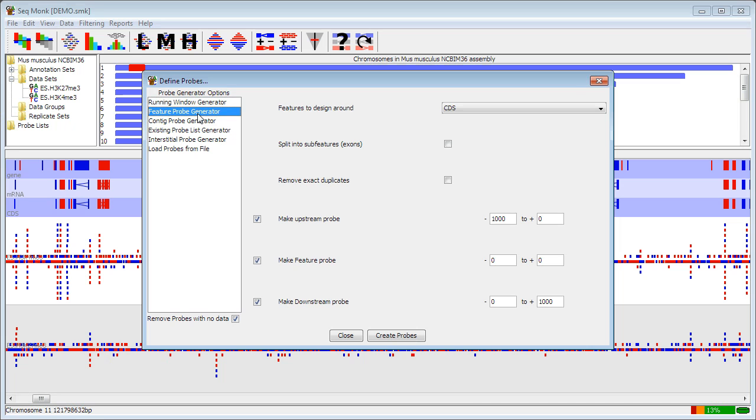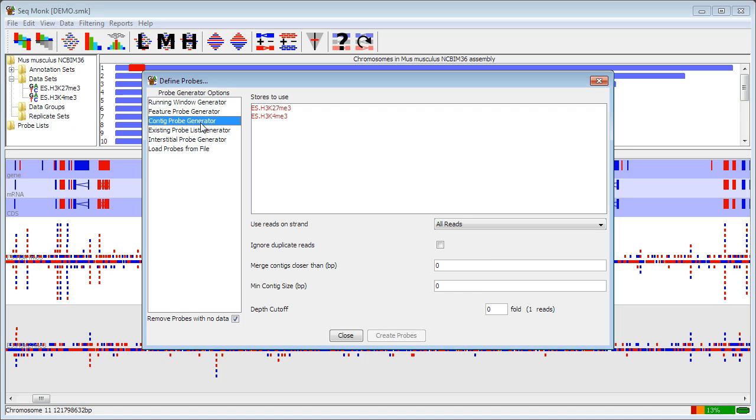You can design probes around features, which is what we're going to come back to do in a second. You can also do contig probe generation, which allows you to select one or more data sets and then uses the data within those to do peak detection. So it looks for regions of enrichment and builds probes over those.